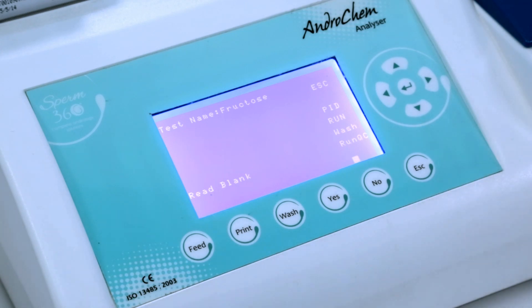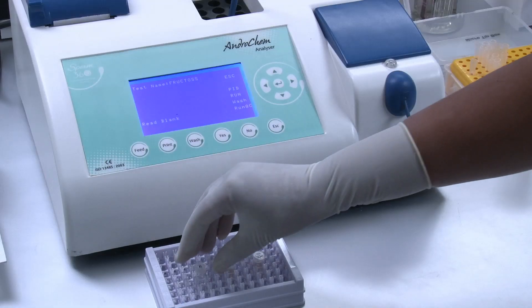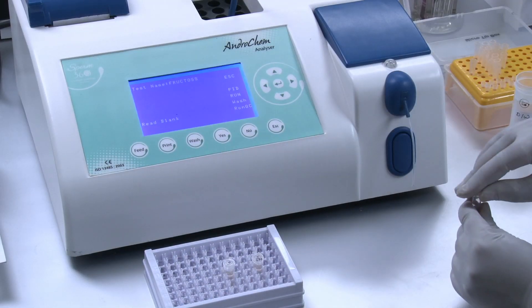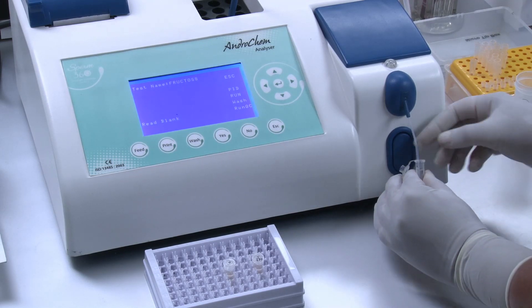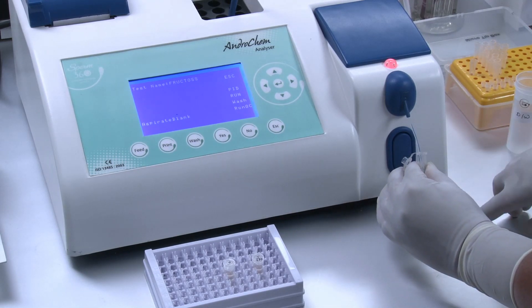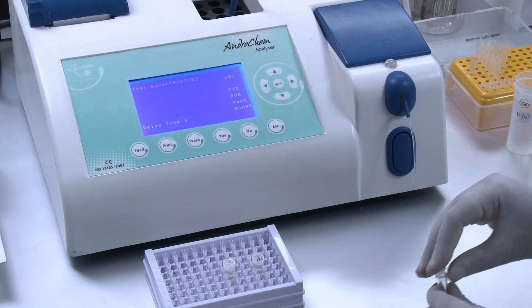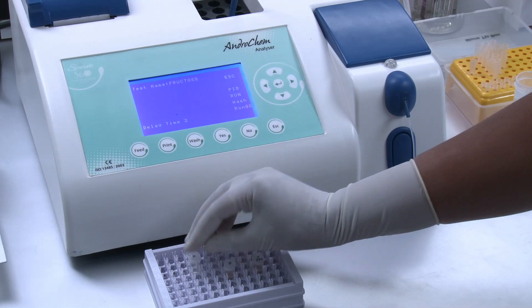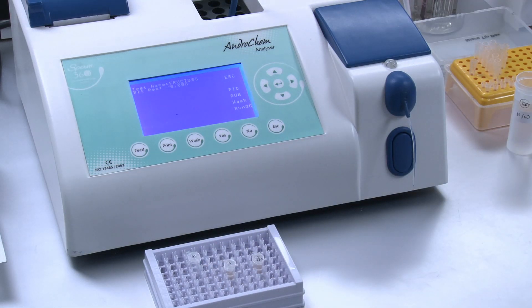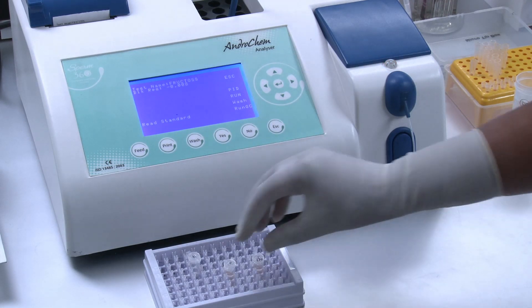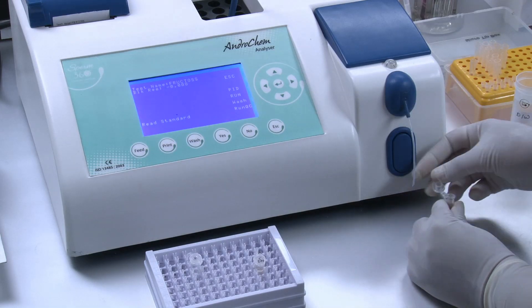The screen displays Read Blank. Aspirate Blank. The screen displays Read Standard. Aspirate Standard.